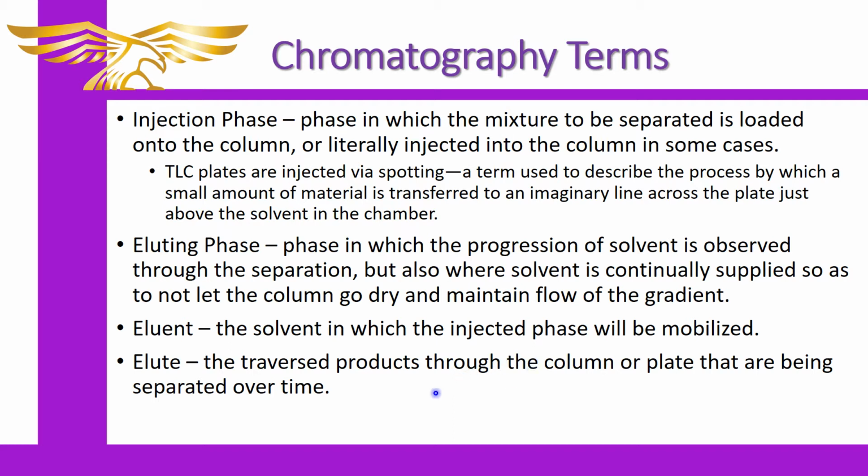Usually they don't put inorganic or organometallic type compounds through chromatography, because they usually crash out of solution pretty easily and can just be filtered. But there may be a case out there somewhere where they're using chromatography to purify something like that. So you never know. But I'm sure they don't want to do that because it's hassle-some.